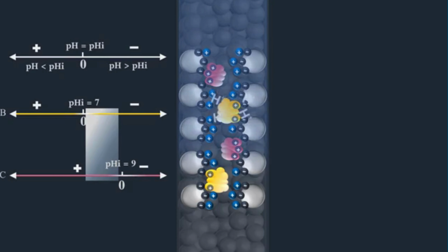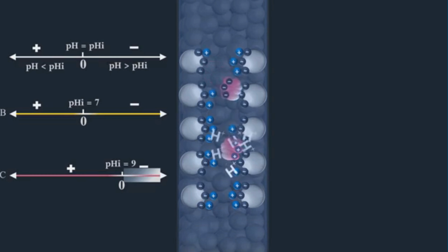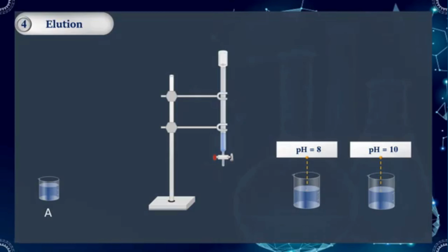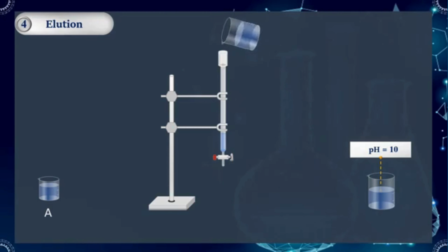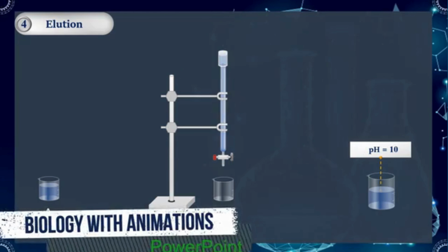Disposal and environmental considerations. An important distinction is between spent regenerant and spent resin. Regeneration transfers contaminants from the resin into a concentrated liquid waste stream. Replacing the resin transfers contaminants into a solid waste. Neither should automatically be regarded as ordinary laboratory or municipal waste. The correct disposal route depends primarily on what the resin has captured.